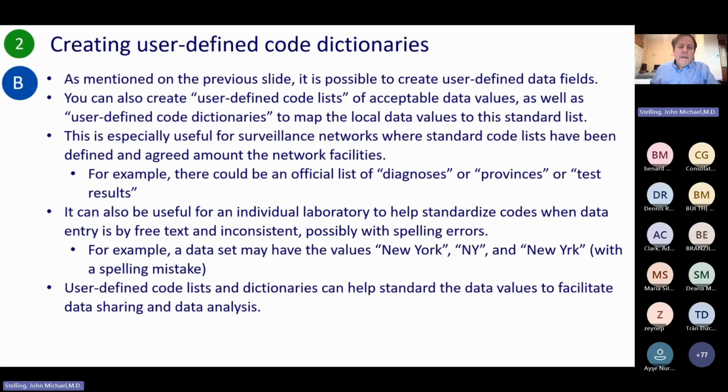WHONET, we don't give you a list of physicians, obviously. We don't give you a list of diagnoses. We don't give you a list of states or provinces or counties. But you may want to make your own list.